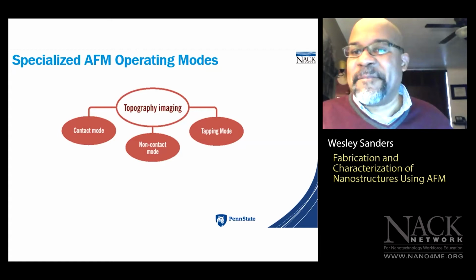Yeah, maybe I can also add to what Wes was saying. Great presentation, by the way, Wes. So far, I was closely looking at your slides. When we talk about lasers, we should always think about their wavelengths too. That's still under the main frame of optical patterning. The wavelength is still 200 nanometers up to a couple of 100 nanometers, but it's still quite large for patterning purposes. So most of the time when you do patterning with lasers, like laser direct writing for, say, photomask writing, they're generally limited by the wavelengths.